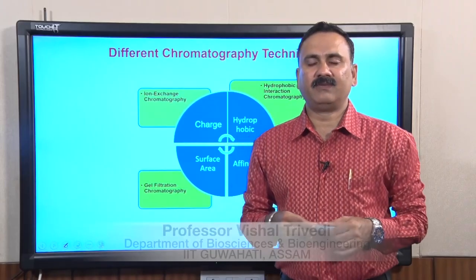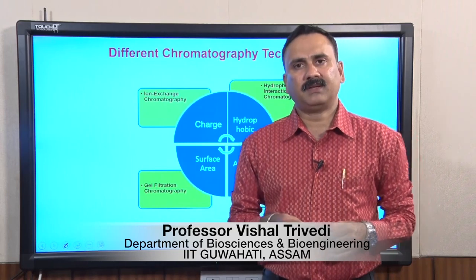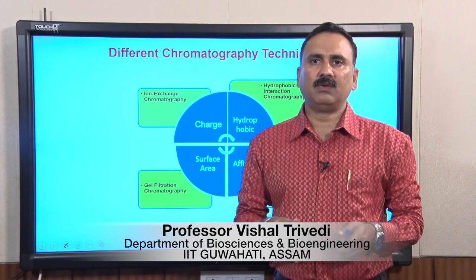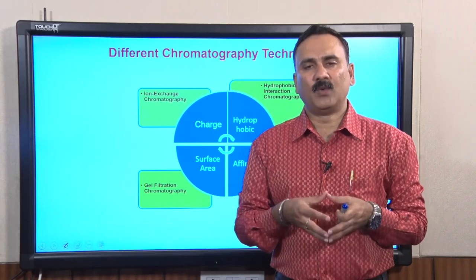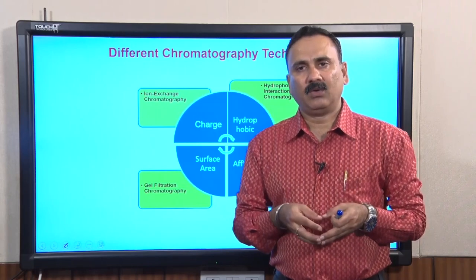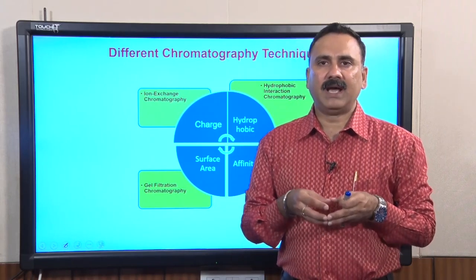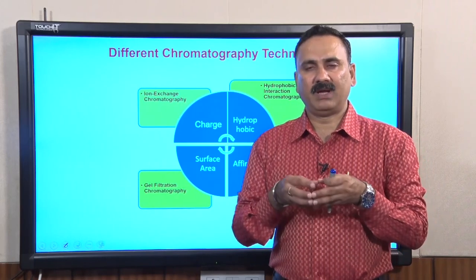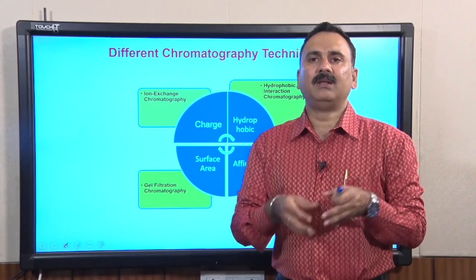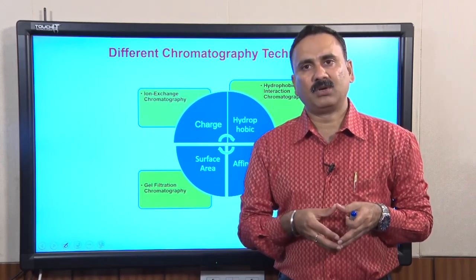Hello everybody, this is Dr. Vishal Trivedi from the Department of Biosciences and Bioengineering, and we were discussing the purification of a product from host cells which are overexpressing that particular product. In this discussion, so far we have discussed ion exchange chromatography, followed by hydrophobic interaction chromatography, and in the previous lecture we also discussed gel filtration chromatography.